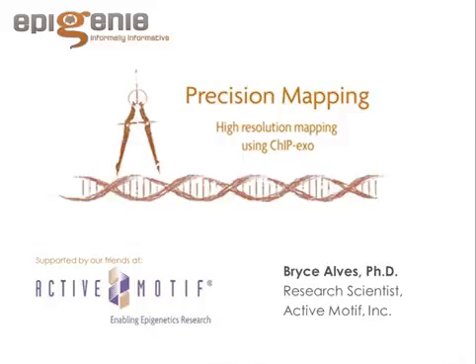Also, are sonication protocols similar for ChIP-Seq and ChIP-Exo? We use the exact same sonication protocol that we use in our ChIP-Seq, which is 30 seconds on, 30 seconds off for 5 minutes of on time, so a 10-minute total cycle, with an amplitude of about 42% on our sonicators. Of course, that's going to differ from sonicator to sonicator. Of course, yeah.